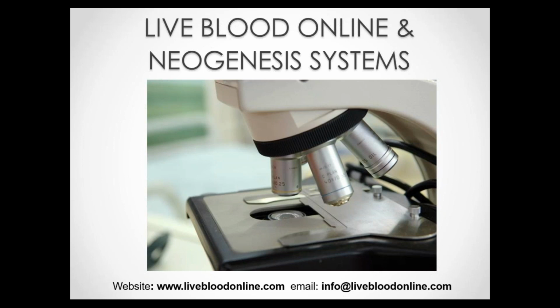So as a second point, the information gathered from a live blood test is vital in determining and deciding on the best course of treatment for a patient. Now, live blood analysis gives us a glimpse of each patient's unique internal cellular environment, so we can see the condition of this environment in real time. So the most important priorities are immediately obvious to the practitioner. And this makes it easier for the practitioner then to choose the best course of treatment for a patient.